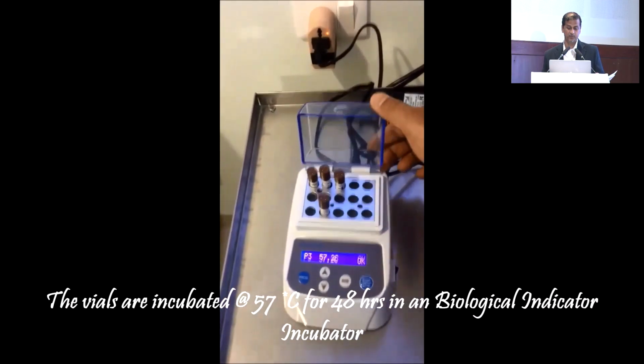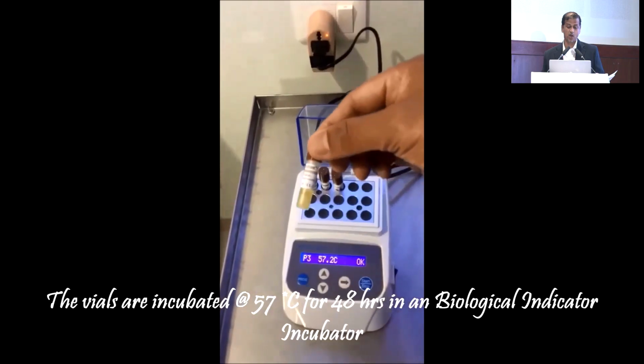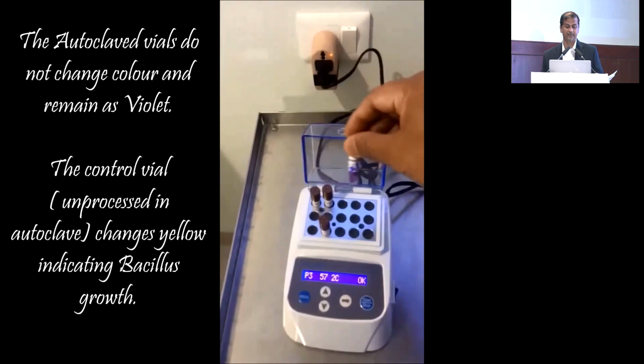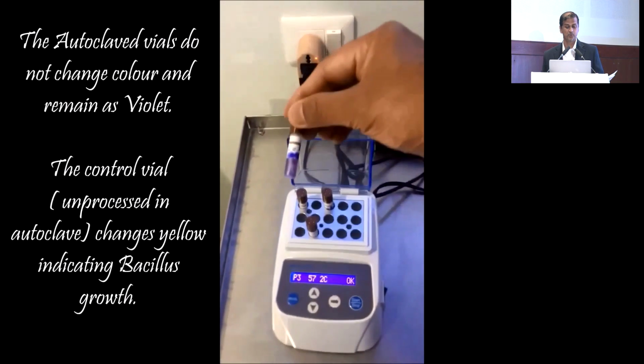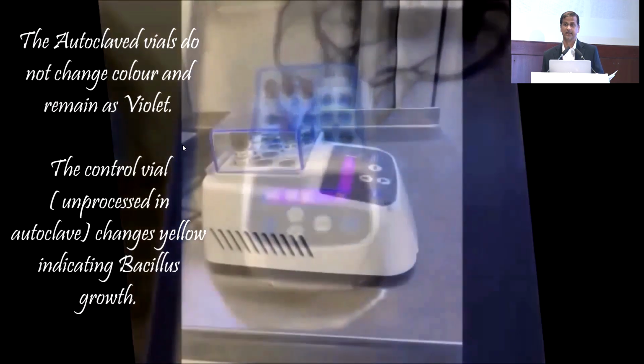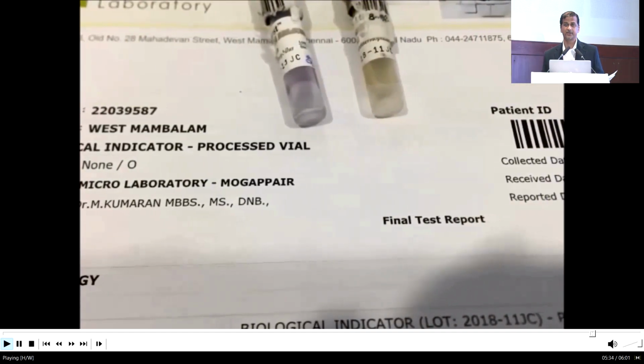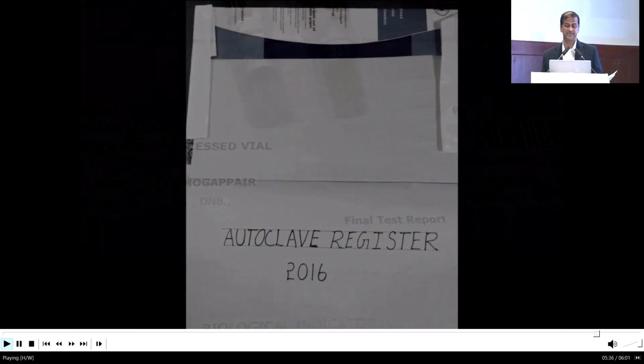And after that, you would see that the vial which has not been processed changed color, which shows that the bacteria has grown, but in the other vial, the bacteria has been killed, so the violet color remains. Understand that this is the most foolproof mechanism which ensures that your load has been sterile.